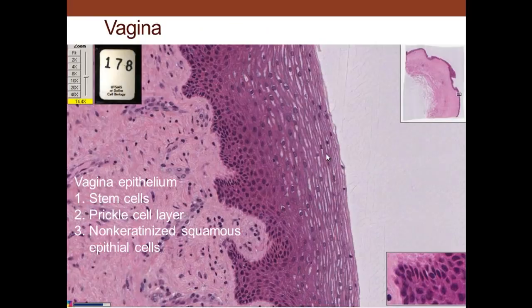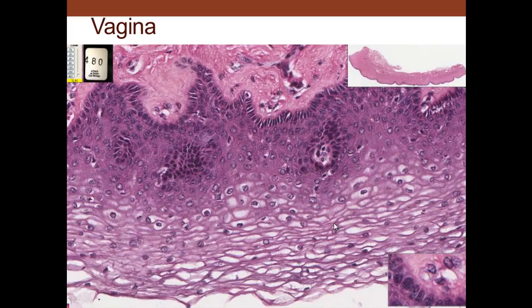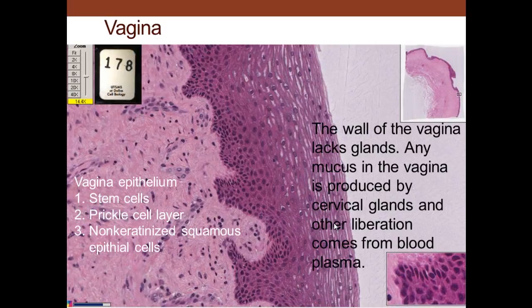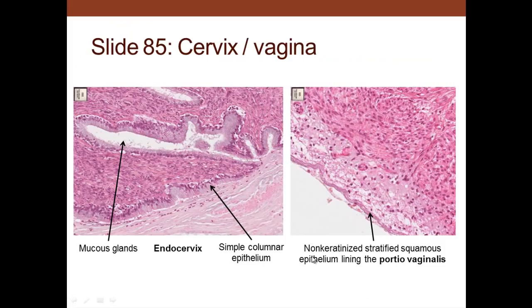We can see the stem cells on the surface — prickle cells — and non-keratinized stratified squamous epithelium is what we have here. The basal cells at the base give rise to cells that are ultimately sloughed off. The wall of the vagina lacks glands; any mucus in the vagina is produced by cervical glands which may slip down, or other lubrication comes from blood plasma — leakage of blood plasma into the lumen of the vagina — and that yields lubrication for copulation to occur.